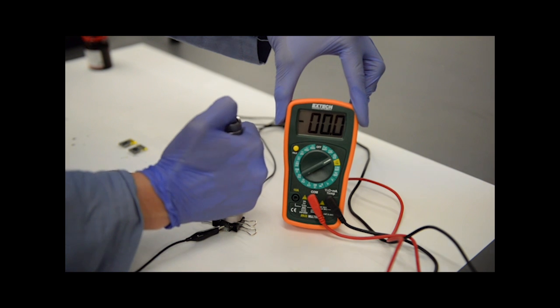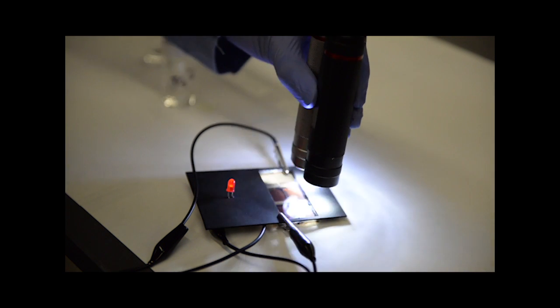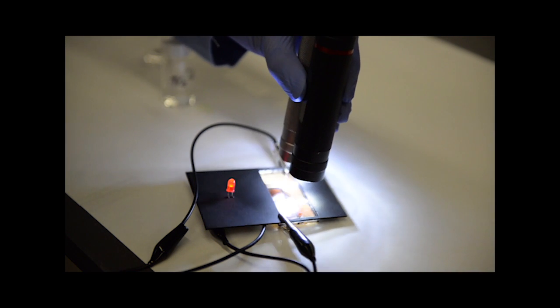Using a very similar procedure, we make high-efficiency cells in our research lab. Here we created a small solar panel that can light an LED.